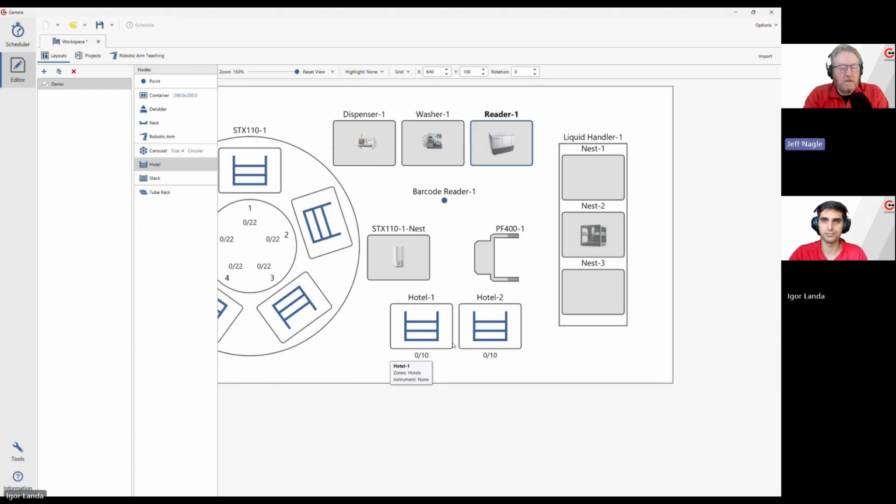Yeah, and the huge benefit to this in either instance, especially for devices. So if a device in a pool were to go down for some reason, maybe a colleague decided to use it standalone and now it's not available as part of the overall operation that you're running, well, that's no longer available in the pool, but the process doesn't stop because there's more in the pool.